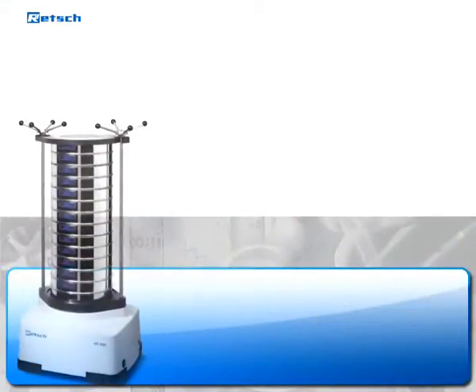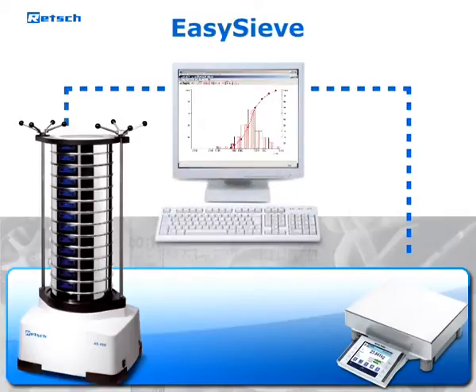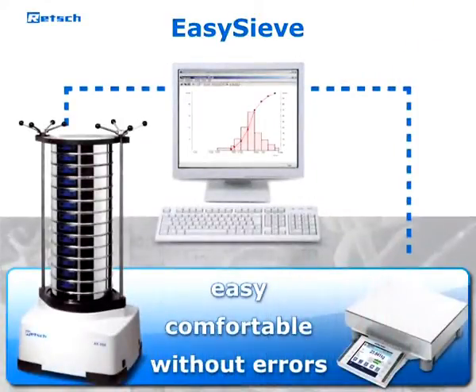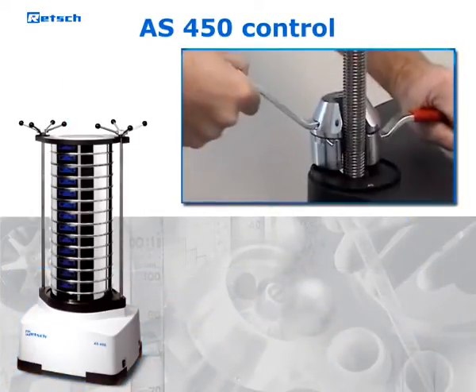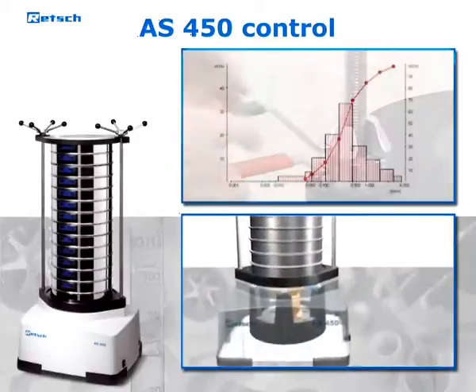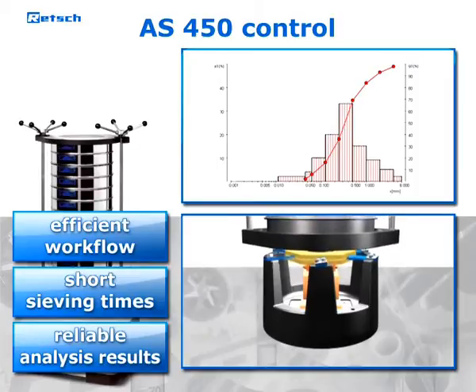Thanks to an integrated interface, the AS450 can be controlled with the evaluation software EasySieve. This program allows control of the entire sieving process and the subsequent documentation easily, comfortably, and without errors. The REC heavy-duty sieve shaker AS450 is characterized by convenient handling and controlled operation. The superior drive mechanism runs without wear and does not require any maintenance. All these features guarantee an efficient workflow, short sieving times, and reliable analysis results.